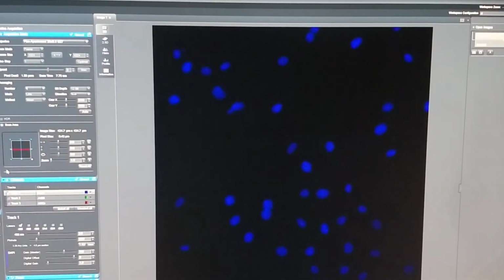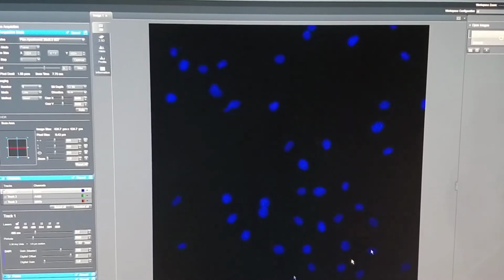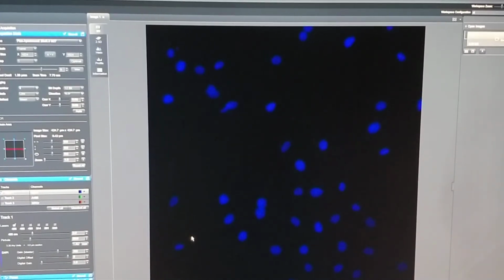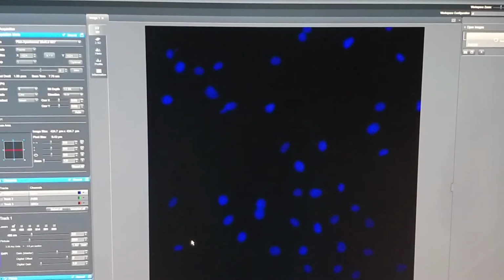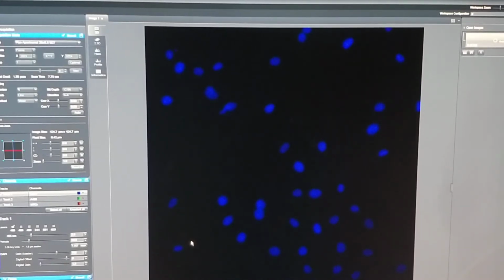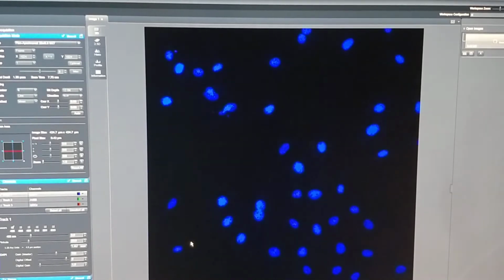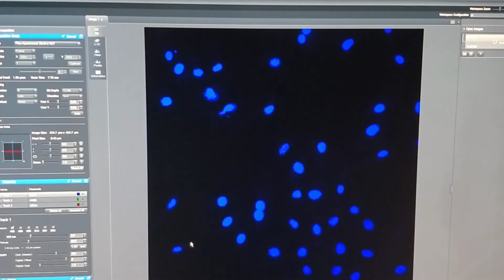When we image live, you're going to see the DAPI. So now the DAPI is a bit unfocused. So I am going to focus it a bit. And this is generally you want to use fine focus for it, okay? So I'm going to focus on it, okay?